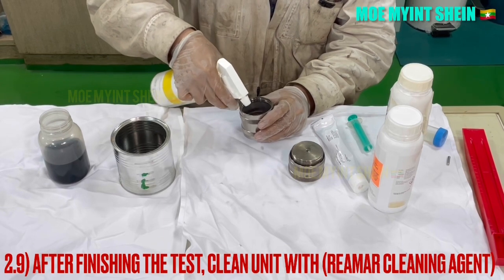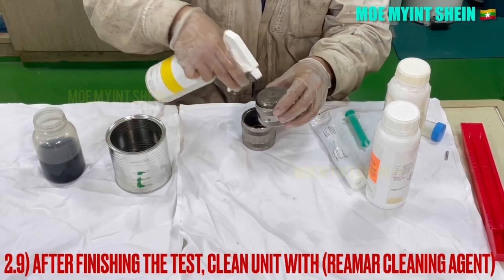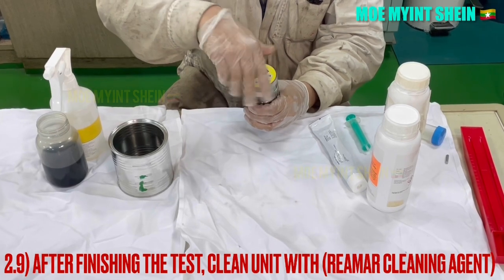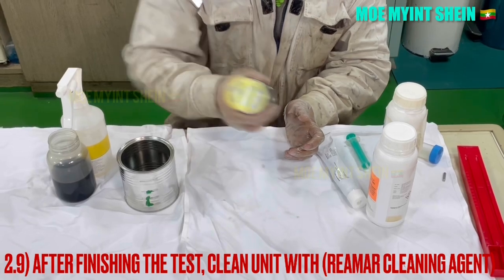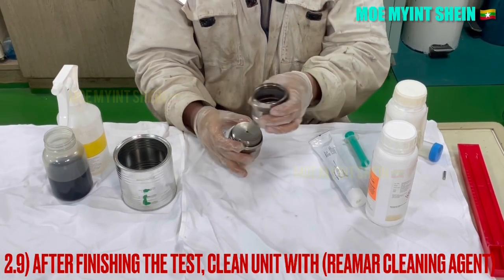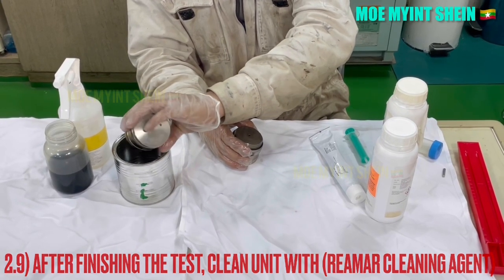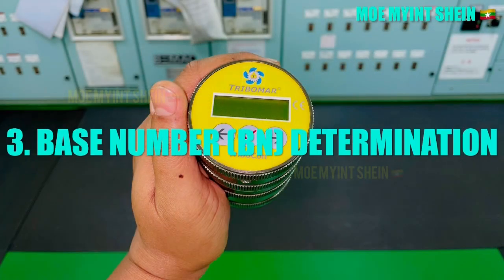Clean the unit with cleaning agent after the test is finished. As a second test, you can see base number determination.